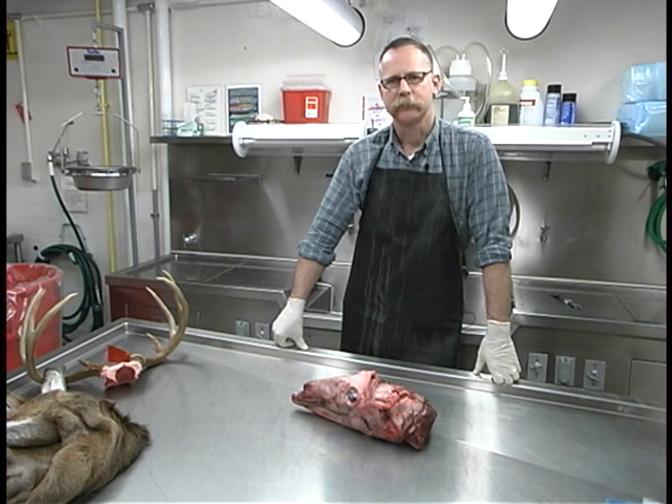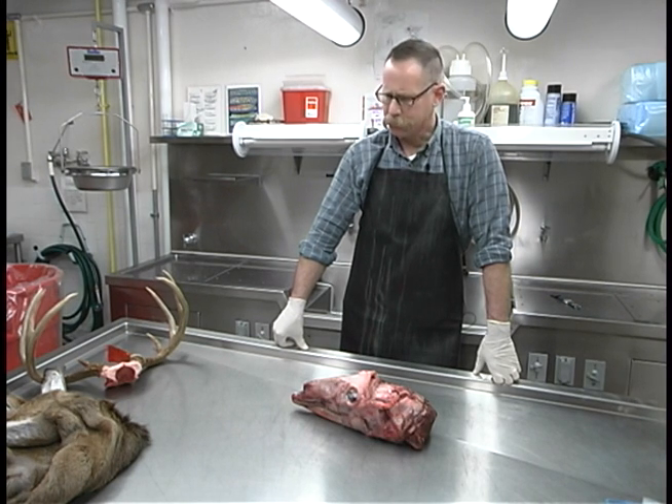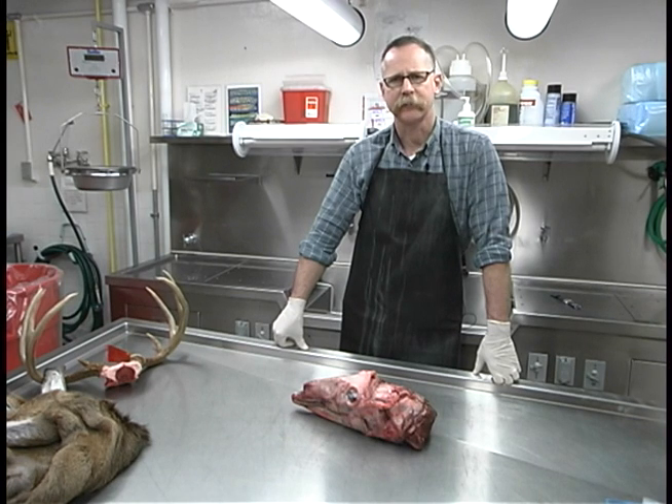Hi, I'm Kevin Hines with the New York State Department of Environmental Conservation's Wildlife Health Unit. Today I'm going to demonstrate how to remove retrofringial lymph nodes from a white-tailed deer for chronic wasting disease testing.